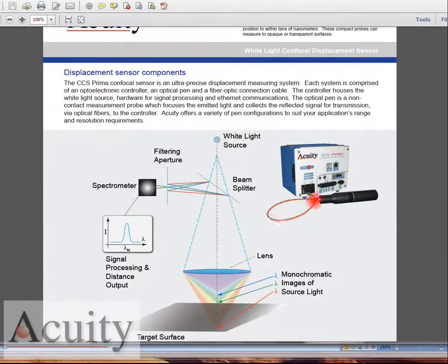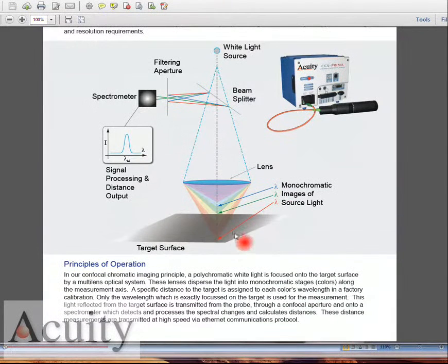This is the technology. Here's the controller and the white light passive probe. What we do is we generate a monochromatic, basically a rainbow here through the lens, and then whatever surface this measurement range comes in contact with, it bounces back up into a beam splitter.